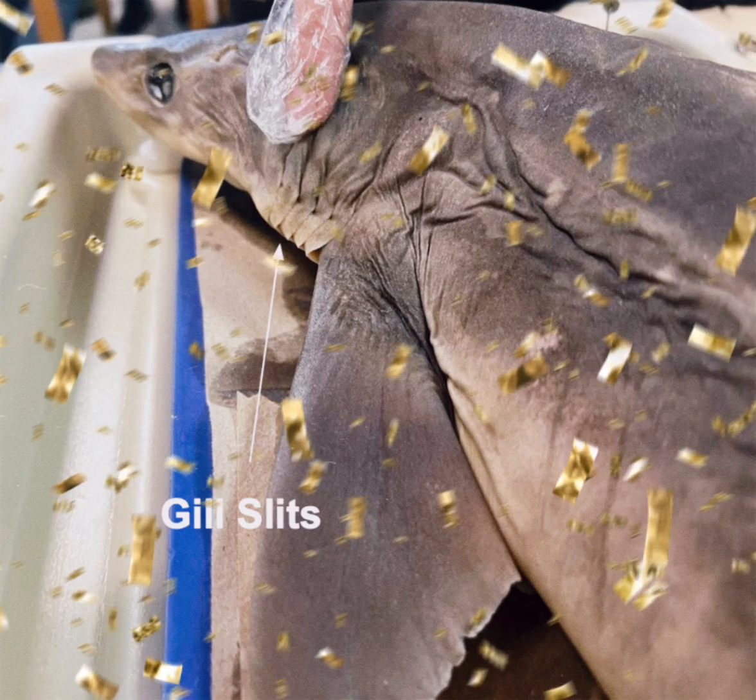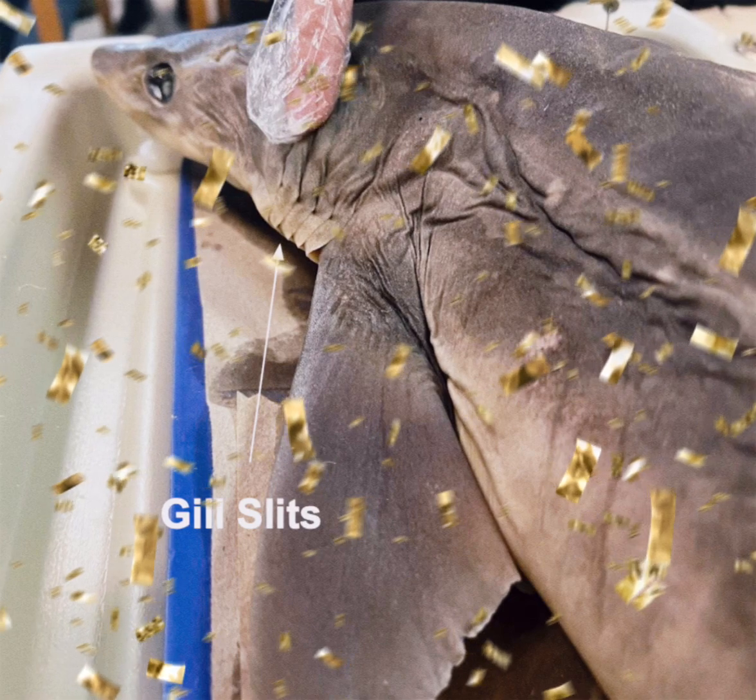Sharks have 5 gill slits, located on the sides of the mouth. Water is taken in through the mouth and spiracles, leaving then through the gill slits.